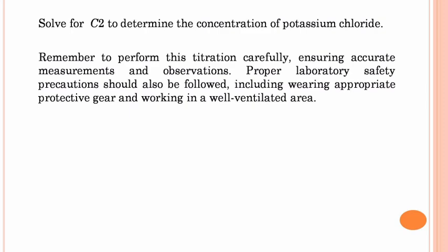Remember to perform this titration carefully, ensuring accurate measurements and observations. Proper laboratory safety precautions should also be followed, including wearing appropriate protective gear and working in a well-ventilated area.